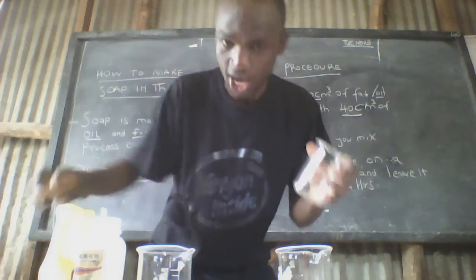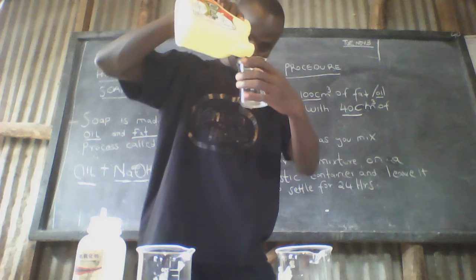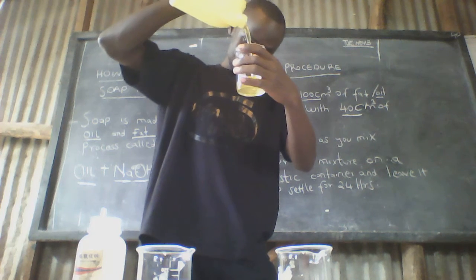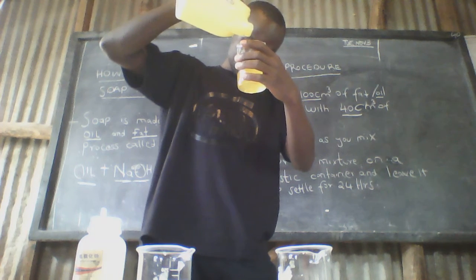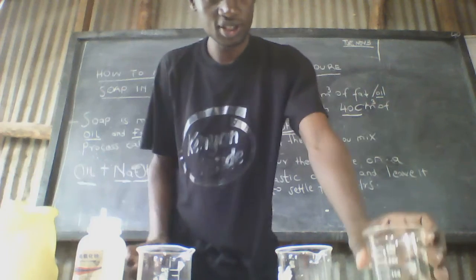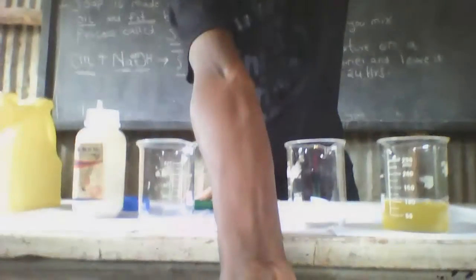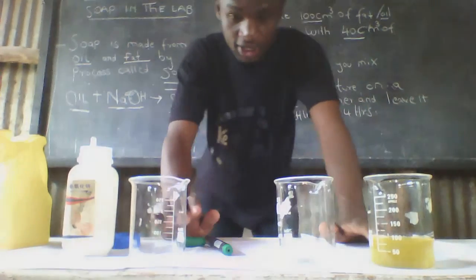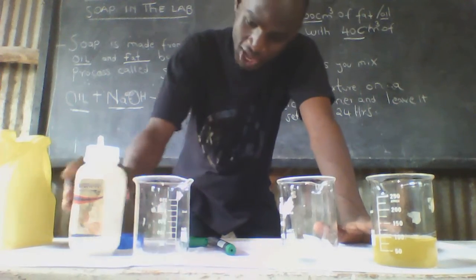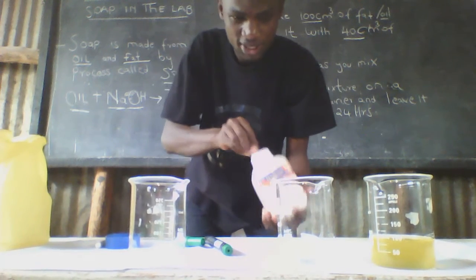Then we shall measure 100 cubic centimeters of this oil. Then we have our sodium hydroxide here.